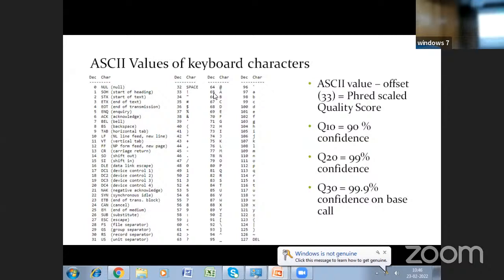In every likelihood, there will be one false positive base call in 100 bases. So if your variant frequency is equal to the random frequency, then all are false positives. Your variant identification must be more than the random frequency. Of course, there are other issues while variant calling, which I'll be discussing. Yes, please.